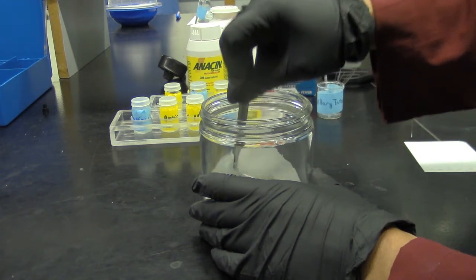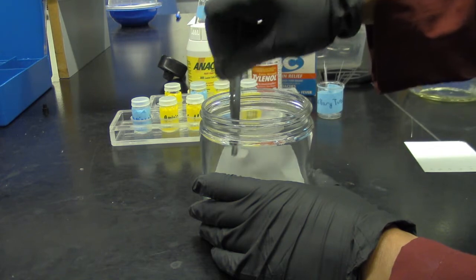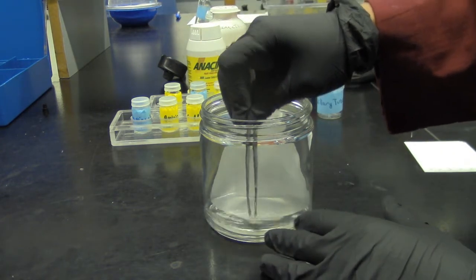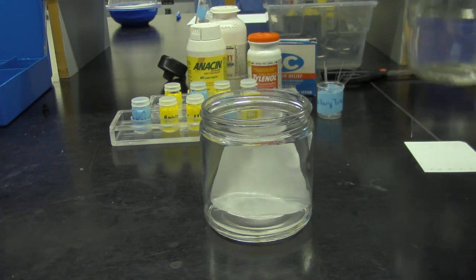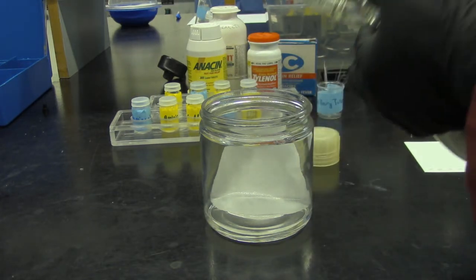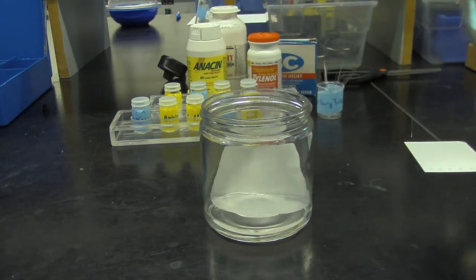I'm just gonna stick it to the wall. Okay, it will also hold the TLC plate upright position. TLC plate is kind of flimsy and thin, so it's difficult to stand on in the chamber. Just add a little more, because yeah, that's good enough.